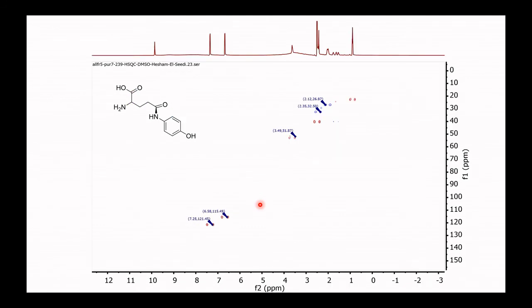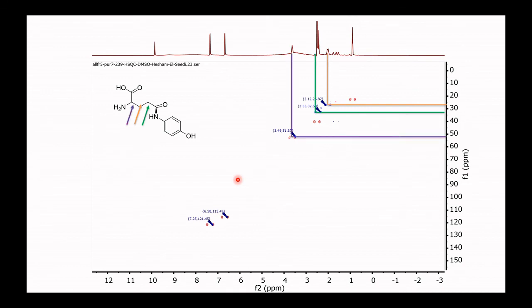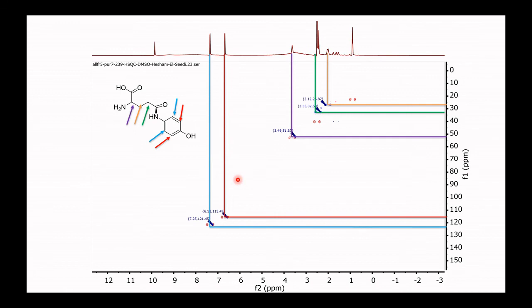And this is the next example. Now I can hear you. What is this spectra? If you see the spots of red and blue, and for each peak there is only one, like this, it means, yes, HSQC. So this is the first proton. You could get the carbon-13. Second proton with more chemical shift of both. Third, next proton. And the aromatic region, it goes to 115. And the next one, which is para substitution.